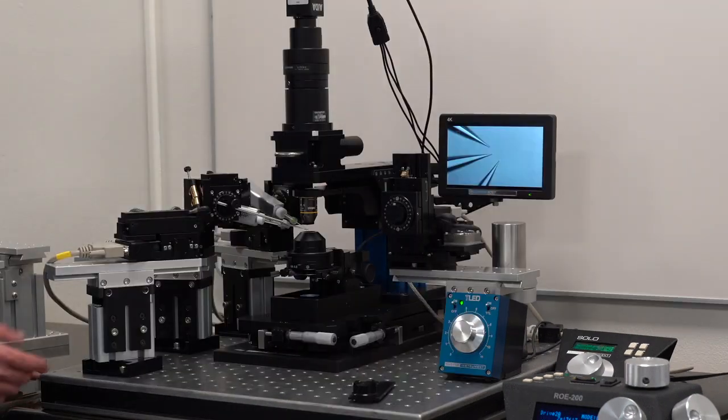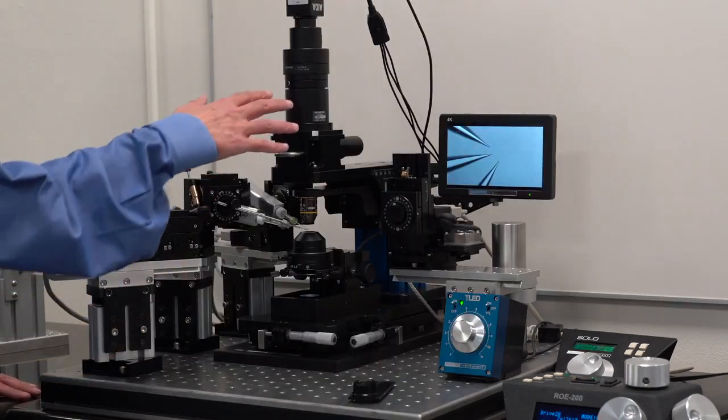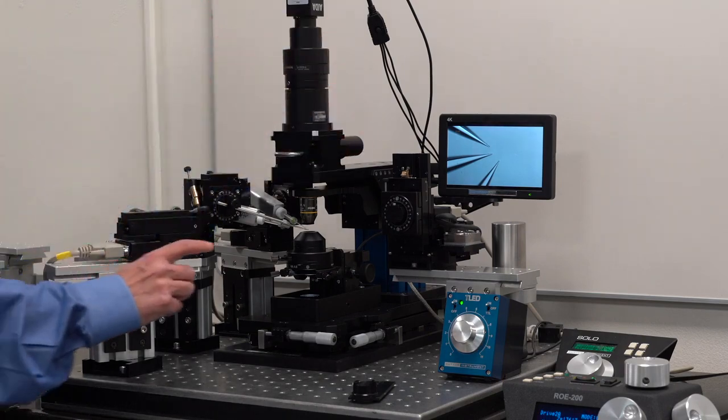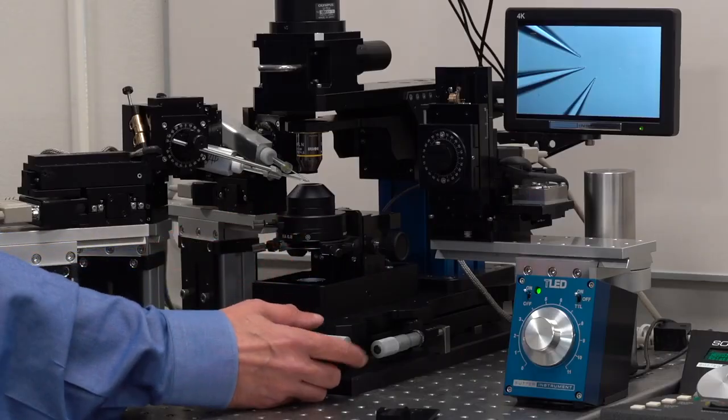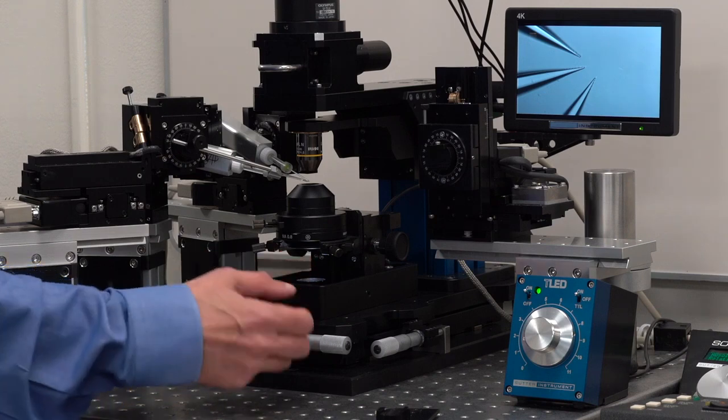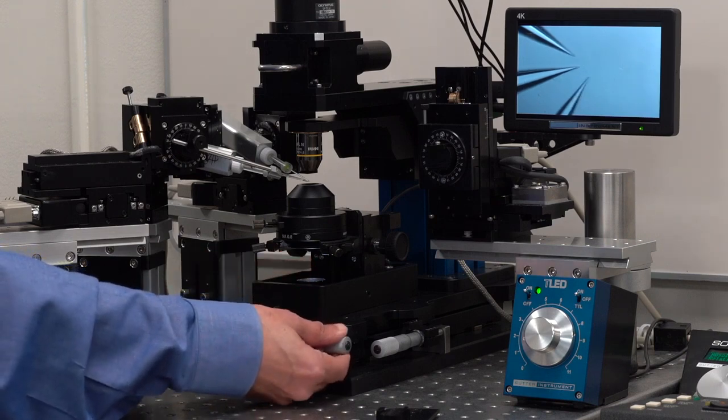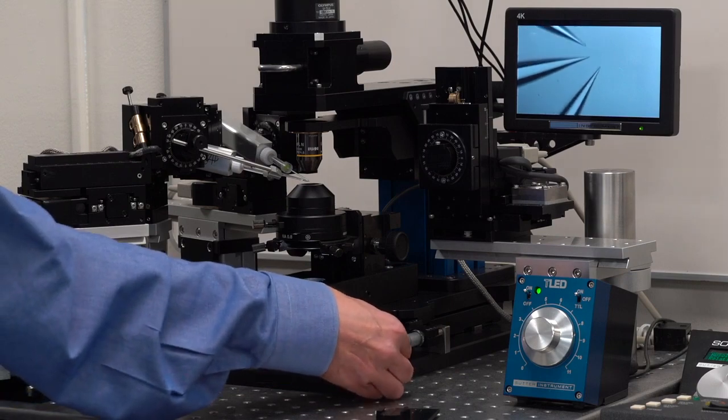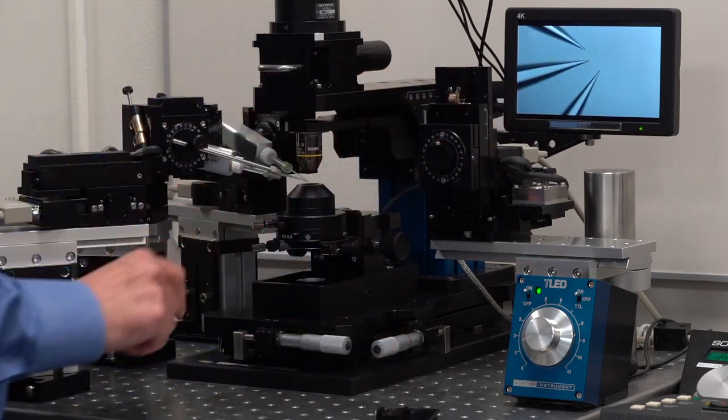As I mentioned before, I love this setup because of the simplicity of the NAND and the area it gives around me. In this case, the NAND is sitting on a manual translator. And as you can see, I can move all three pipettes together in X and Y. And you saw the Z focusing motorized.